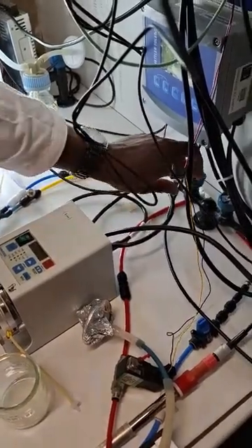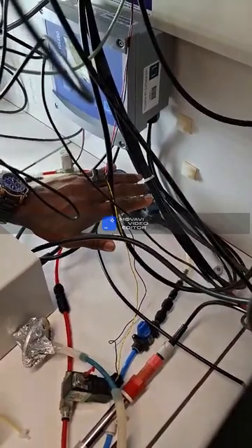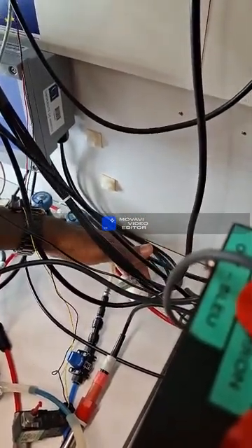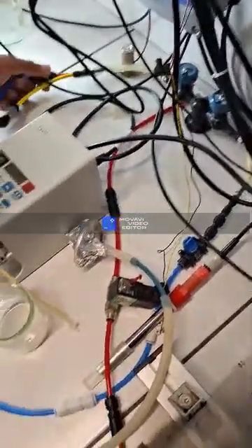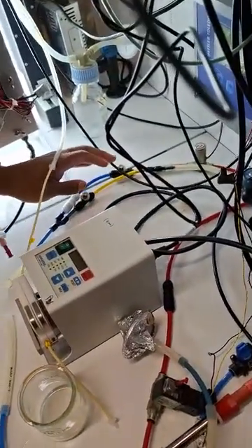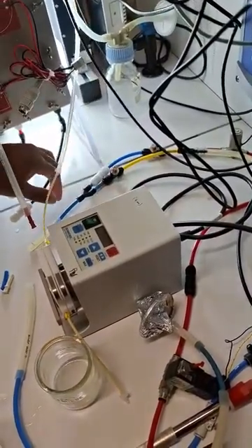These valves are just for air, and here it's for the carbon dioxide, CO2. And here you have some valves to regulate the flow rates for carbonic gas and air.